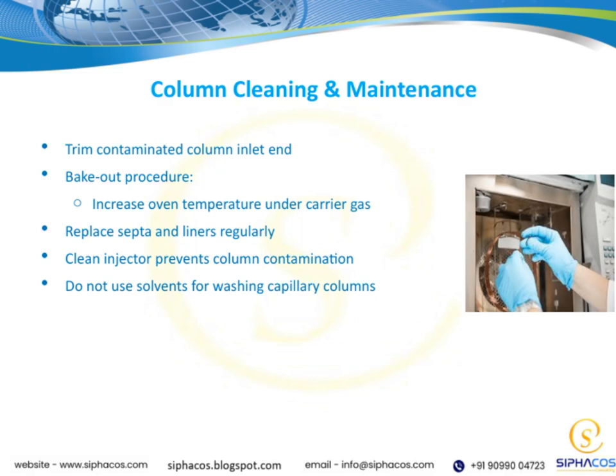And a key point to remember: avoid using solvents to wash capillary columns. Solvents can leave residues or damage the delicate coating inside the column, so stick to proper cleaning protocols. Overall, diligent maintenance and timely cleaning are fundamental to maintaining optimal column performance and ensuring the accuracy of your results.